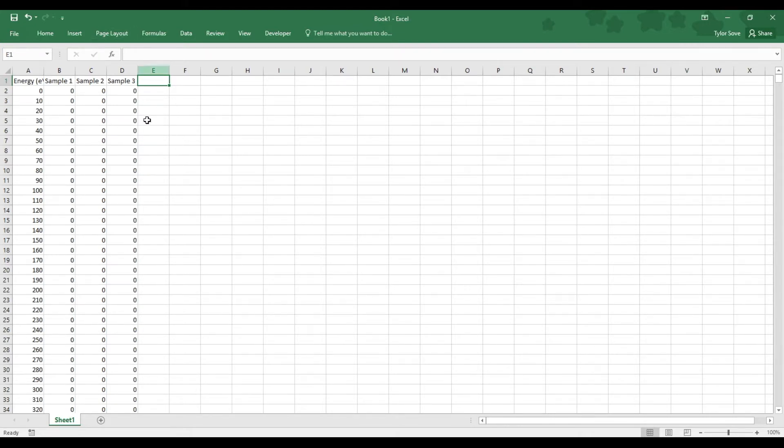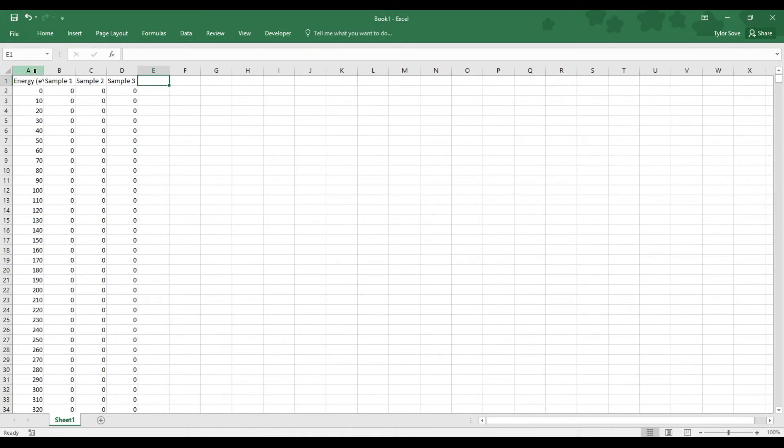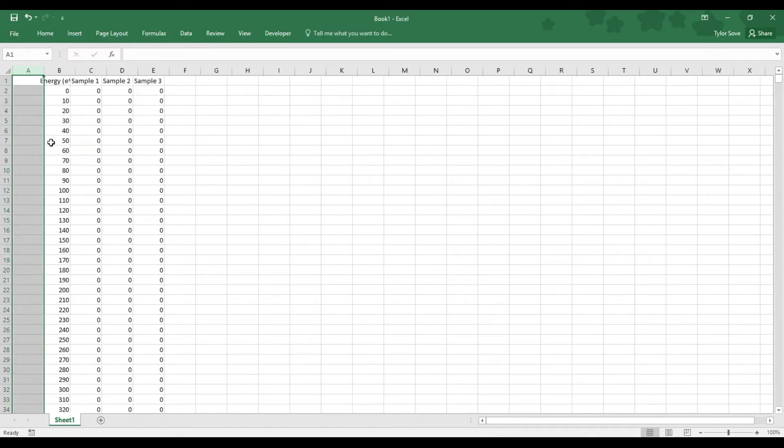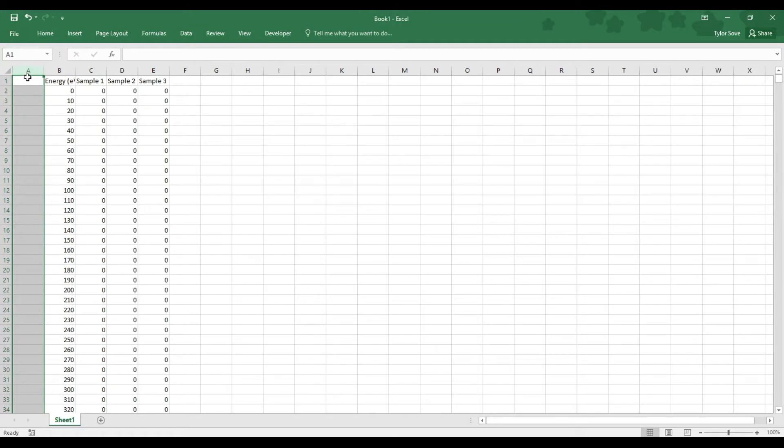This formatting is fine for a traditional XRF graph. We need to manipulate this slightly to get it into a waterfall graph. The first thing we will do is insert a column to the left of the energy column. Do so by highlighting the column A header, right click it, and select insert.